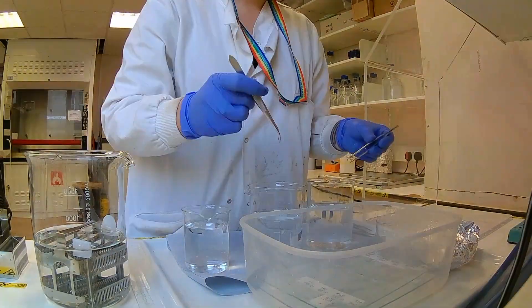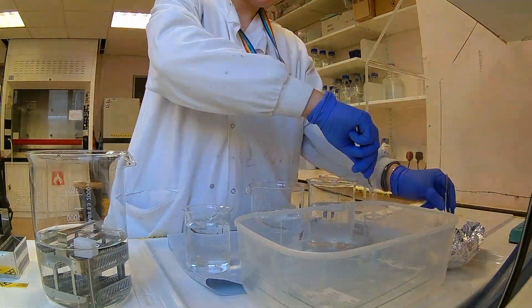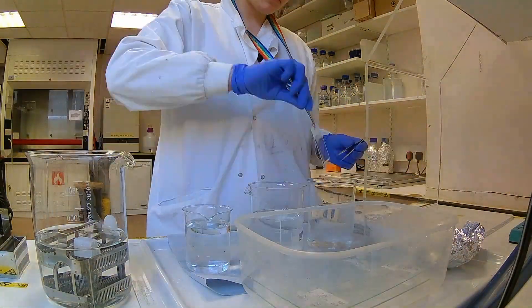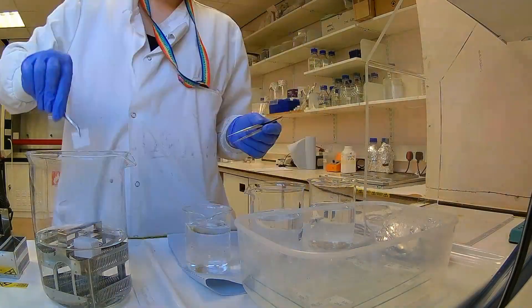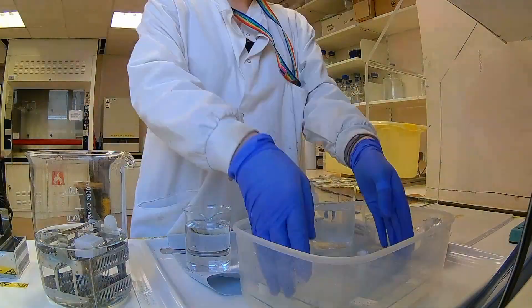The next morning, I come in and start washing all these slides in a buffer to get rid of the excess. That gets rid of any unbound probes that haven't found their match, because if they haven't found their match, then I can't use them.